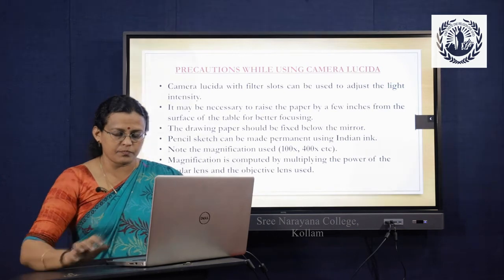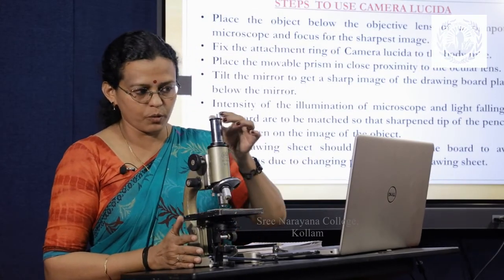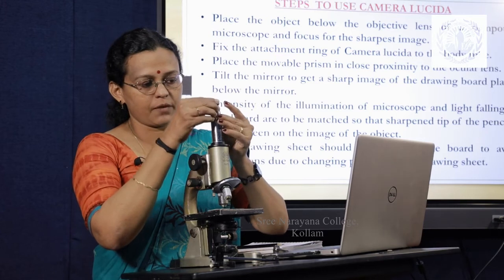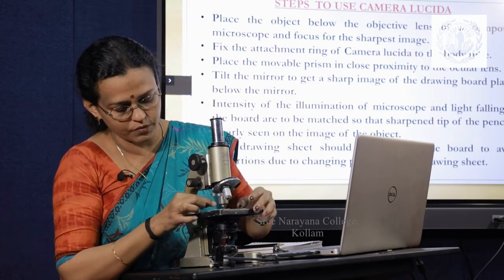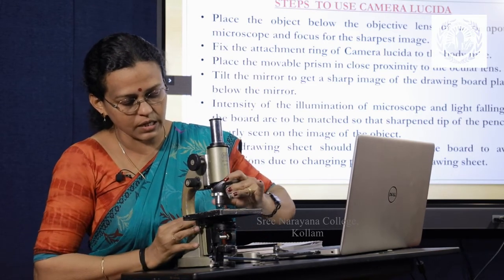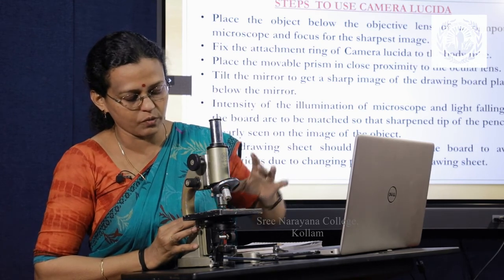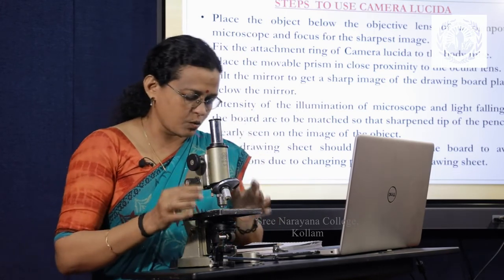Okay. So now you know the different parts of a compound microscope. You have a pair of lenses. This is the ocular lens which shows 10x. The magnification is already seen here, and here you have the nose piece onto which the different objective lenses are attached. You can just turn this, whether it is high power or low power, whichever magnification you want to use. So this is a combination.